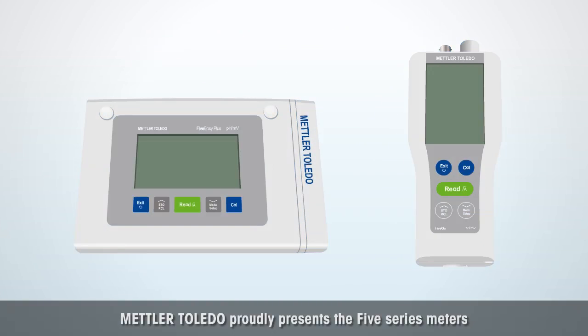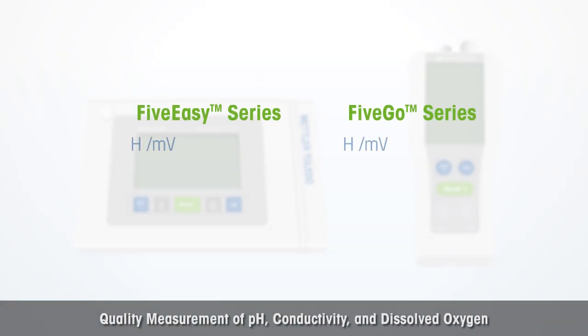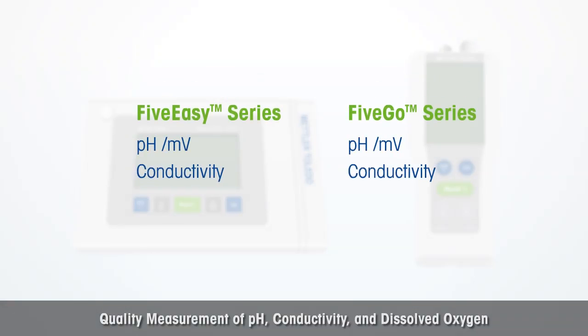Mettler Toledo proudly presents the 5 Series Meters. Quality measurement of pH, conductivity, and dissolved oxygen.